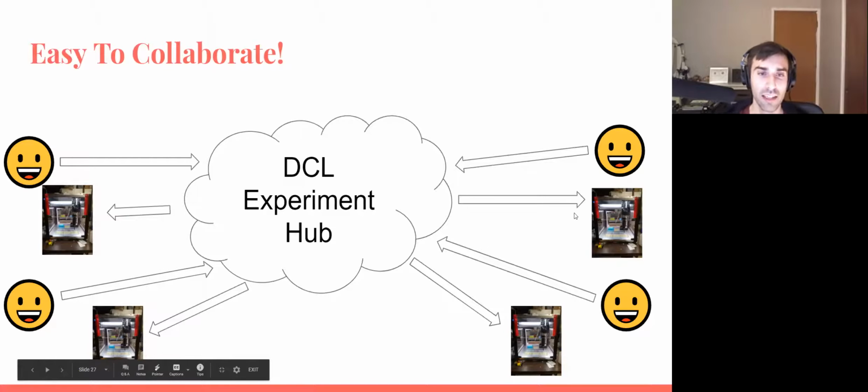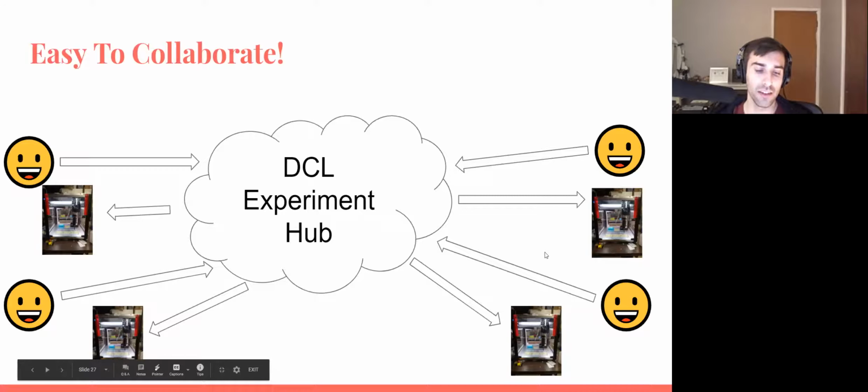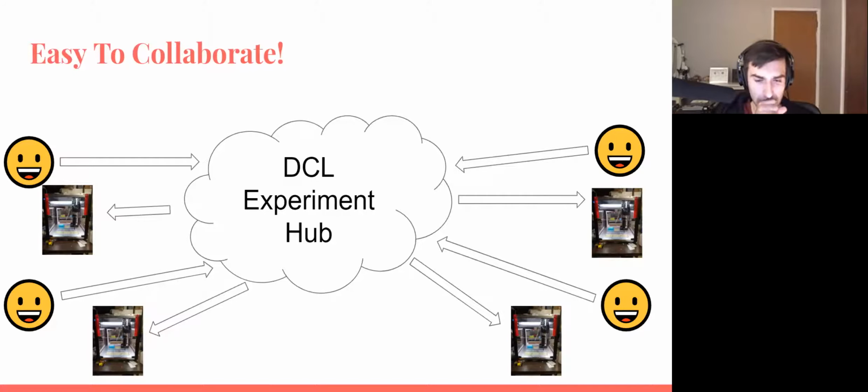So this cloud lab concept has been floating around for maybe 10 plus years at this point, with varying results. Some places have had pretty good success with it. Other places have really struggled. Ultimately, from what I've been reading, the issue is that it's hard to do technology transfer. Most science experiments are not plug and play. But that doesn't mean it can't be done. It's just you have to be careful.